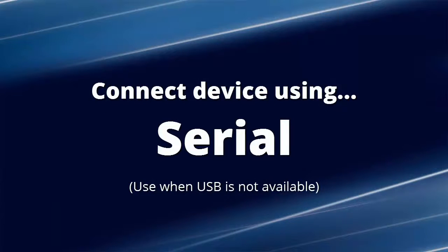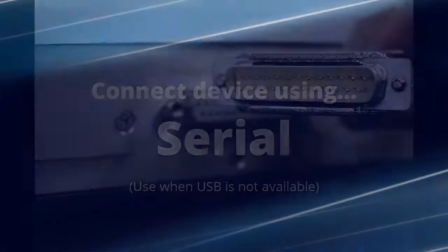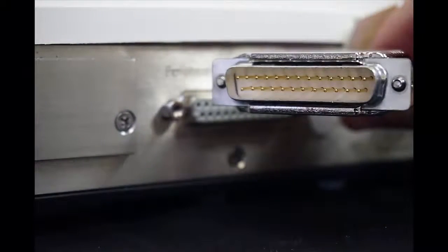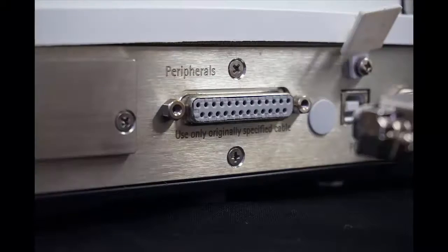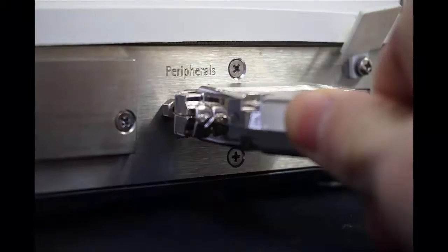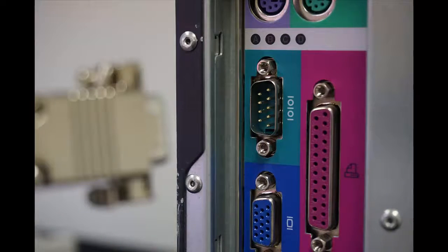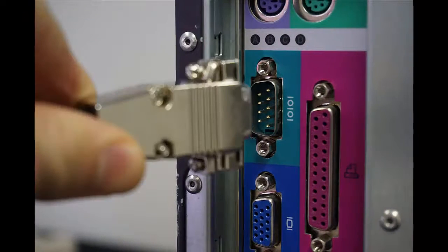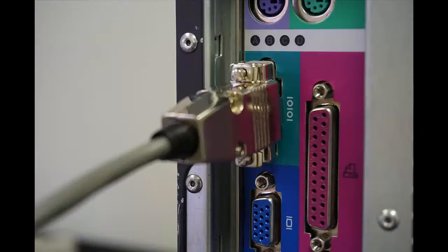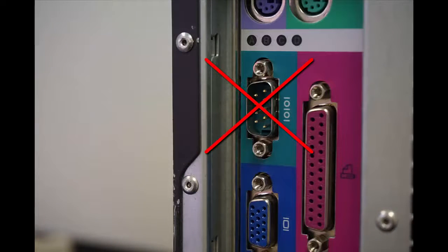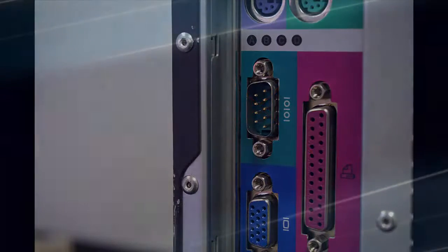Plug the 25-pin connector directly into the scale and the 9-pin connector directly into the PC. If your PC doesn't have a serial connector, don't worry—there are many options available.